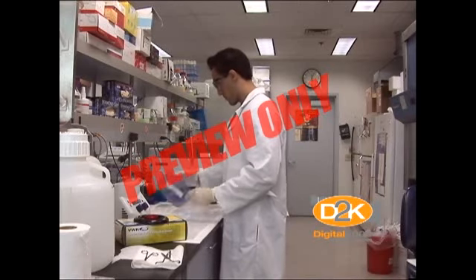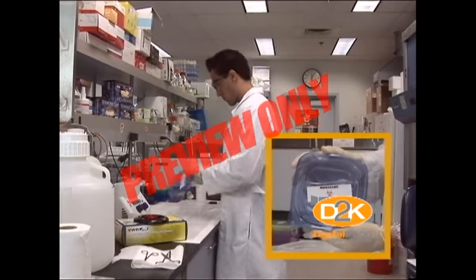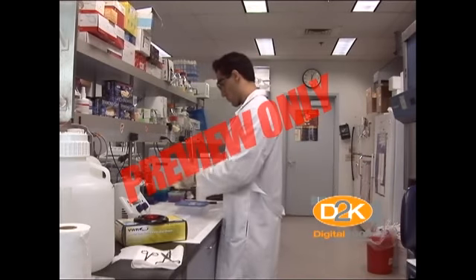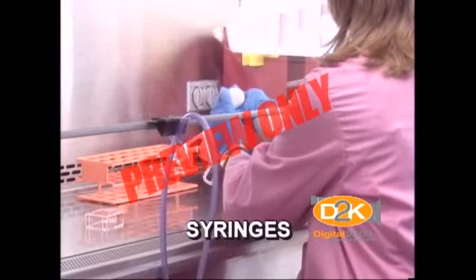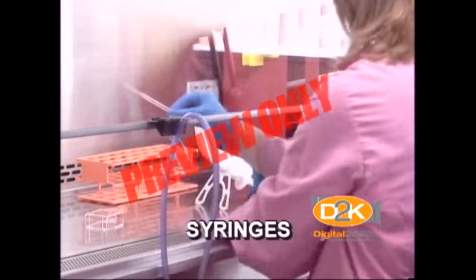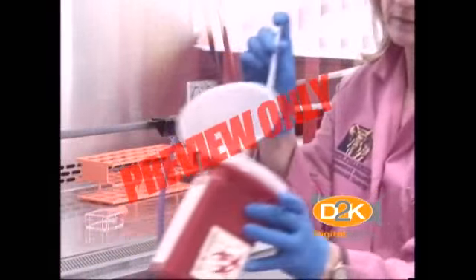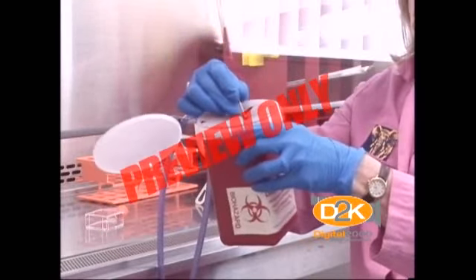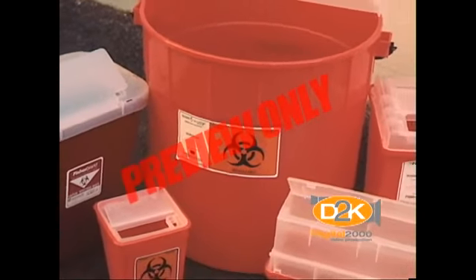You should always use secondary leak-proof containers when transporting samples, cultures, inoculated petri dishes, and other containers of biohazardous materials. The use of syringes and needles requires a lot of care. Always use a needle locking or disposable needle unit. In any case, you must take care not to stick yourself. Never recap used needles or remove them from the syringe. Needles should always be disposed of in an approved sharps container.